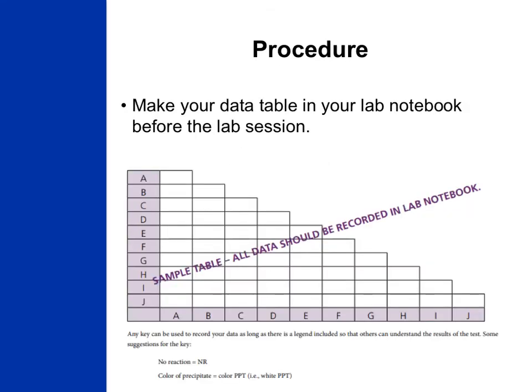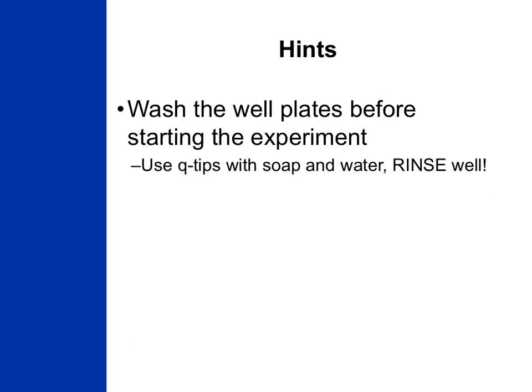The easiest way to organize your data is to kind of make a matrix. We know from the scientific method that you want to test one variable at a time, so you're best off starting off by testing one reaction at a time, one substance at a time. So you want to approach this, like I said, from building a matrix, and you'll work your way down your column. The nice thing about the matrix also is that you can use it to fill in what you see. So for instance, if you see a reaction occurring between solution A and solution B, you can write in that you saw a precipitate and its color. Not necessarily this is what you're going to see, but it's something that you can do.